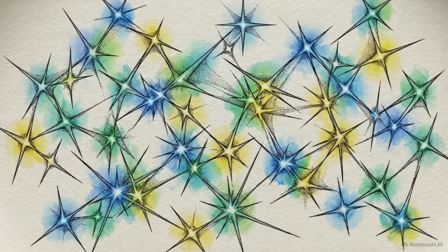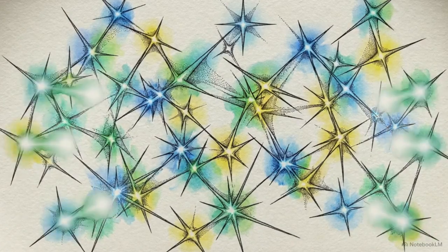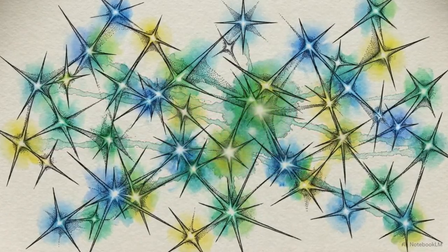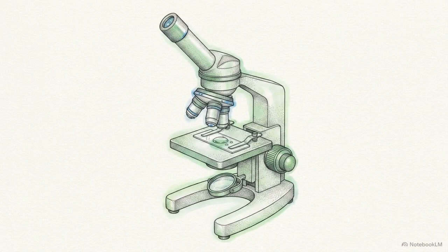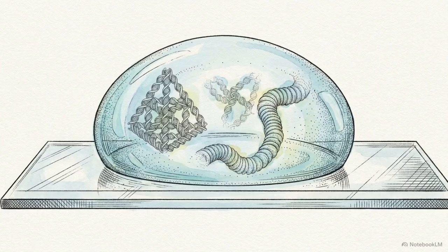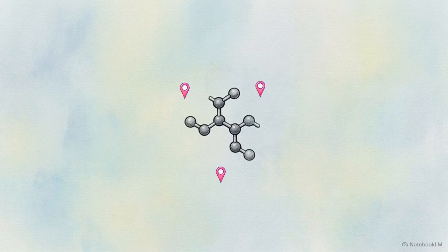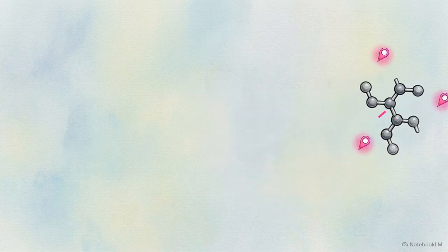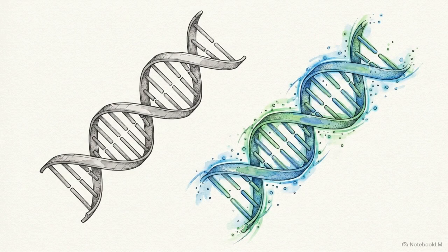Super-resolution microscopy is the disruptive optical solution to this fundamental boundary, achieving 5 to 50 nanometer resolution. Unlike electron microscopy, these techniques operate in operando. Researchers observe materials directly in their native solvents, avoiding the need for freezing or vacuum states. By tagging specific components with fluorophores, researchers can trace individual molecules in real time. This capability allows us to rewrite the foundational kinetic models for DNA, lipids, and supramolecular polymers.